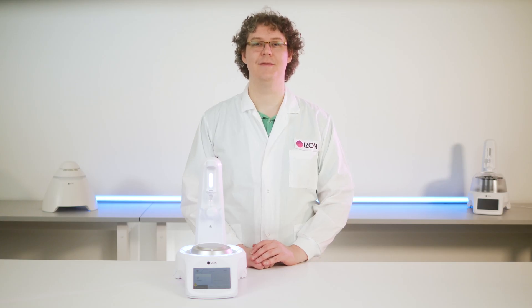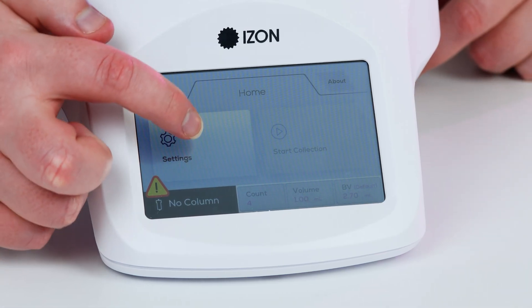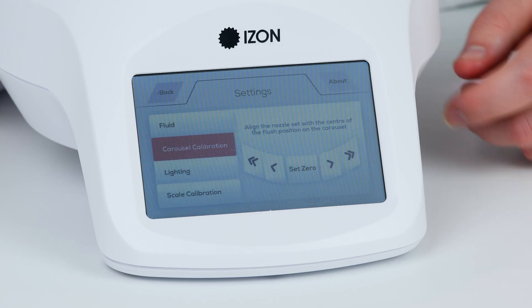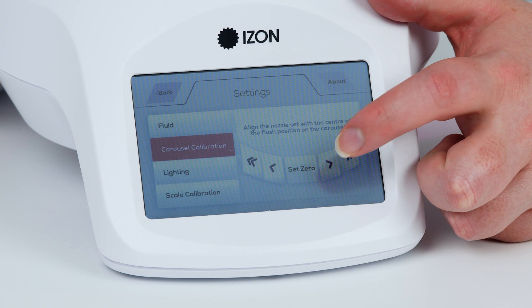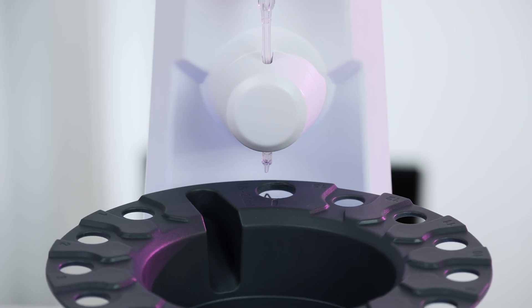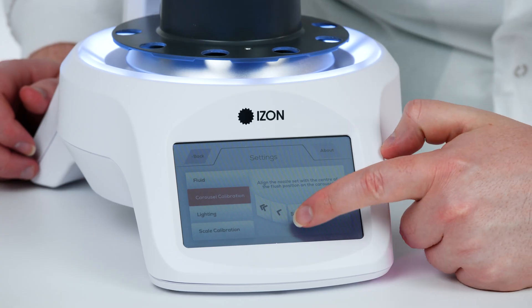There are two things on your AFC that need to be calibrated: the carousel position and the scale. To calibrate the carousel position, select Settings and then select Carousel Calibration. Using the single arrow for fine adjustments and the double arrow for large adjustments, maneuver the hole to be directly below the nozzle, then press the Set Zero button. It is important that the carousel is properly aligned so that no liquid misses the collection vessel.